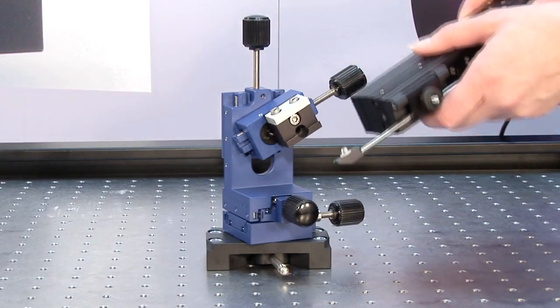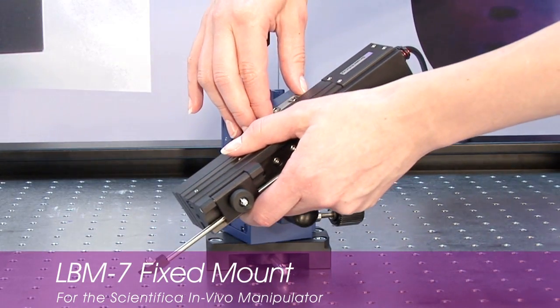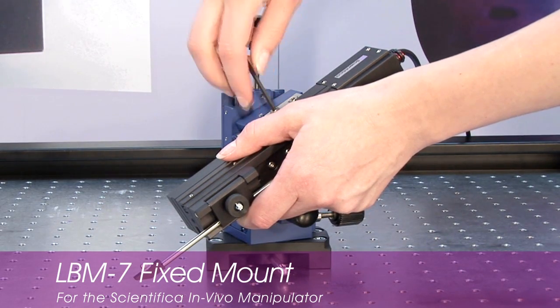This small bracket is designed specifically to mount the scientific in vivo manipulator. It gives strong and stable support for the high precision manipulator for steady in vivo patching.